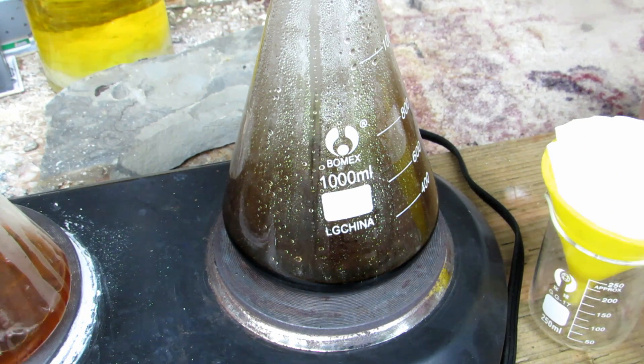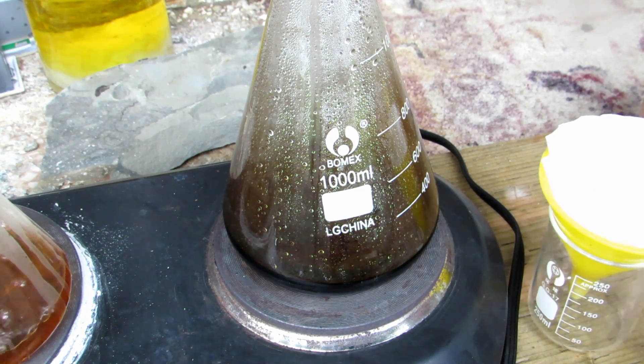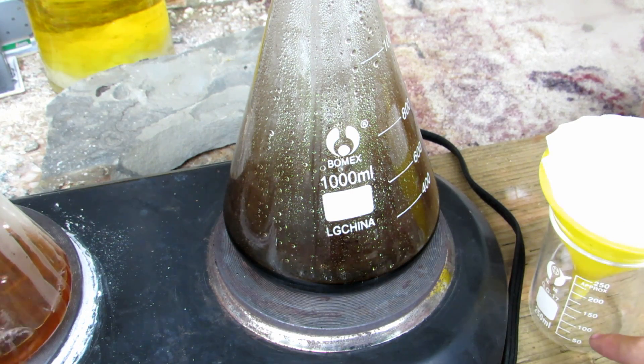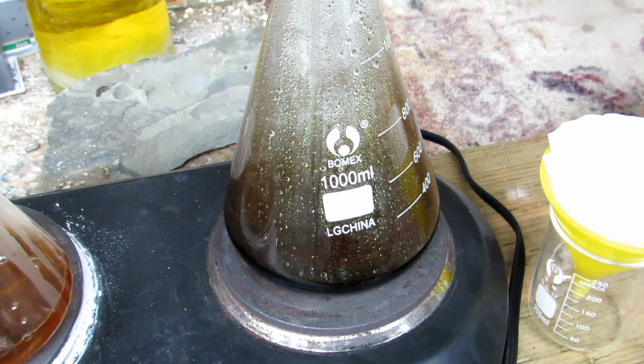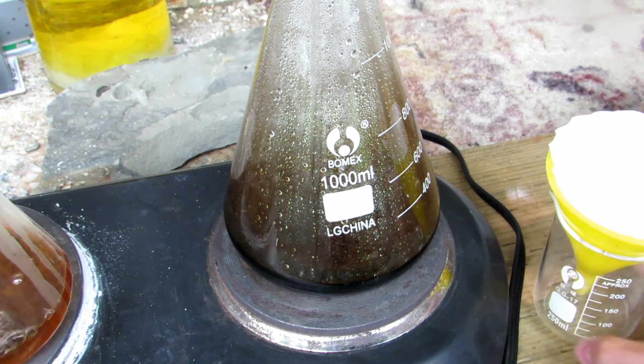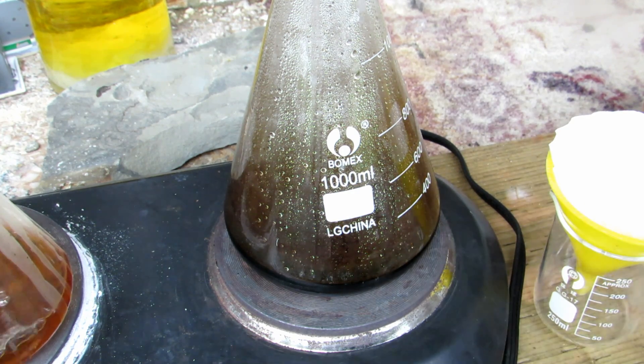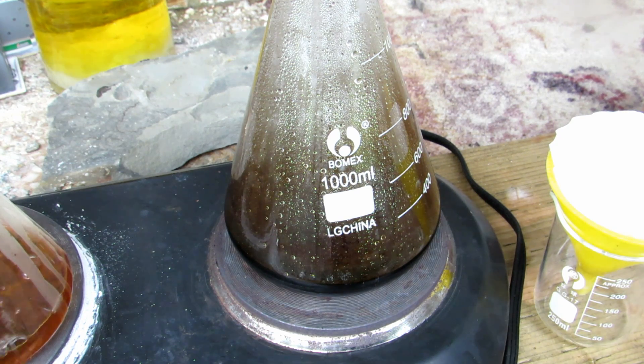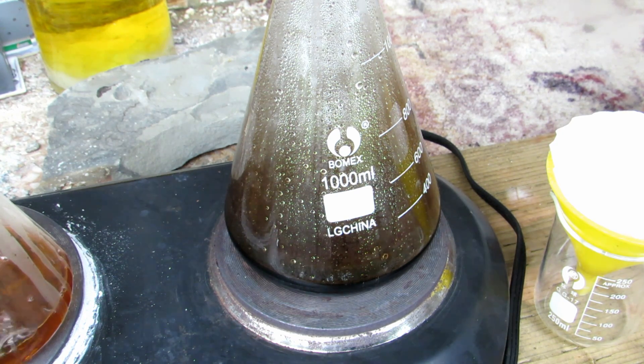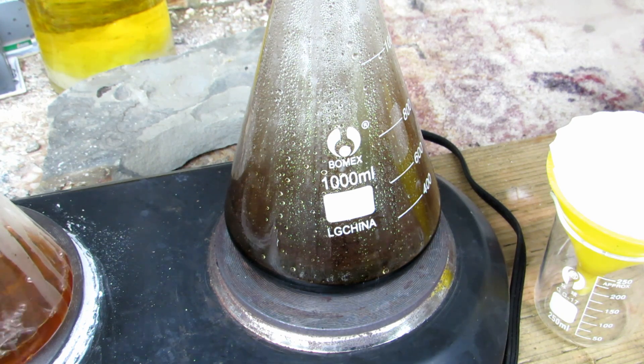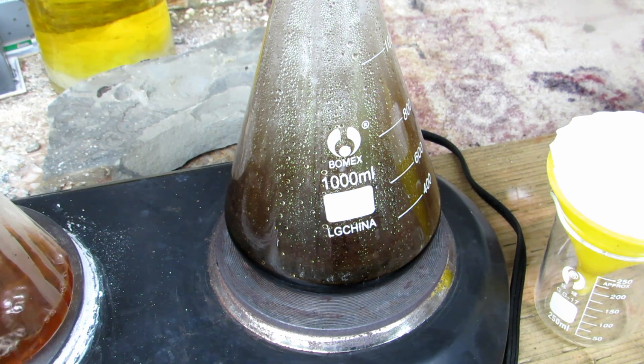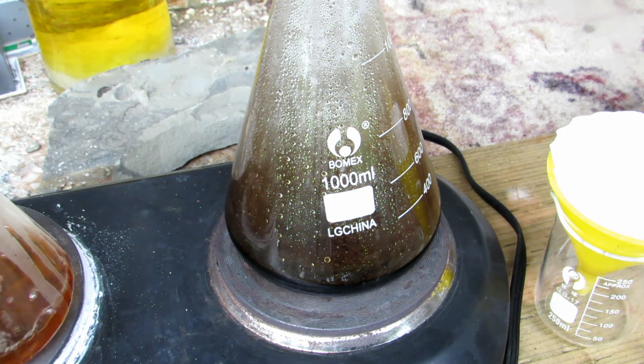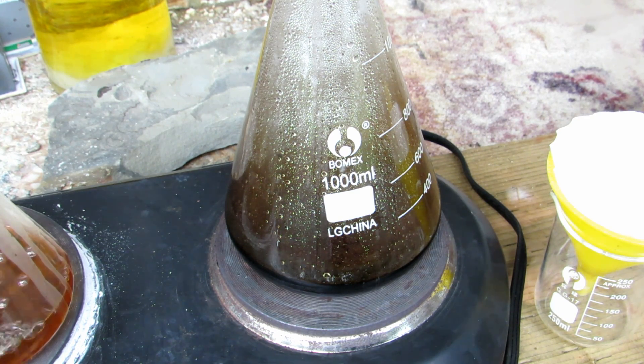We're going to quickly gravity filter it. I'll pour everything into this filter paper here. I'm going to transfer this beaker onto the hot plate once we're done filtering to keep the solution warm. As it filters through and stays warm, hopefully the caffeine will stay in solution. I've decided to use water instead of ethanol because water is easily obtainable. Ethanol can be difficult to obtain for some people, but everyone can obtain water.